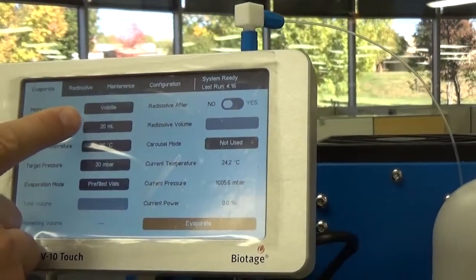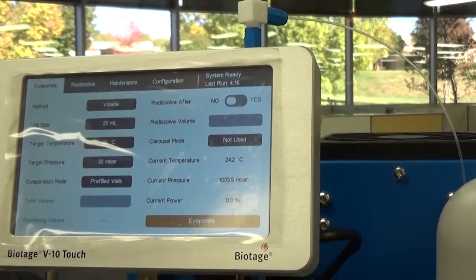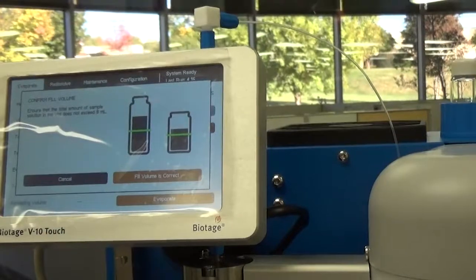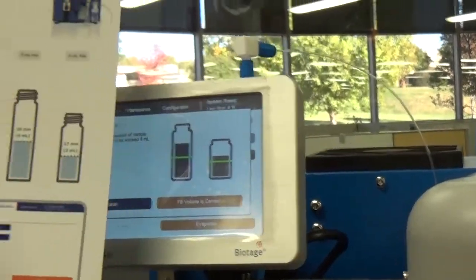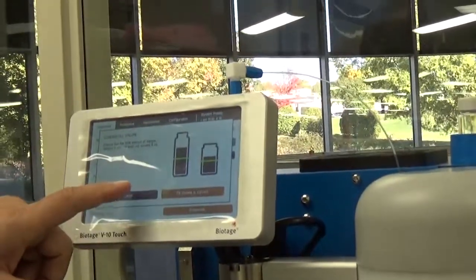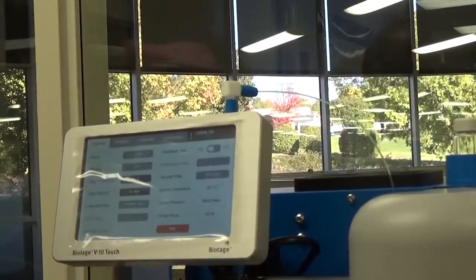Also, just make sure that you've got the right vial size. And once that's all set, you just hit Evaporate. This reminds you to do what we already did, which is check to be sure where we've got the right amount filled into the vial. And then press Start.